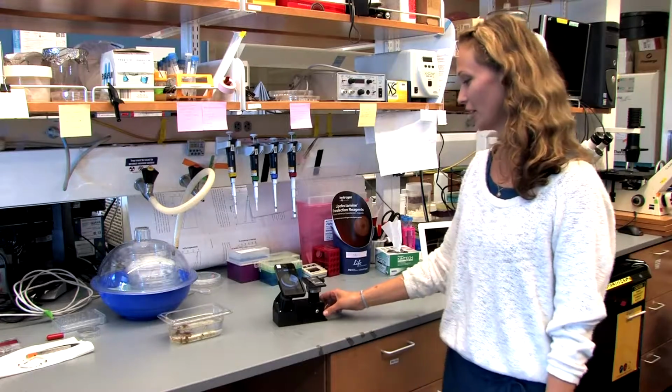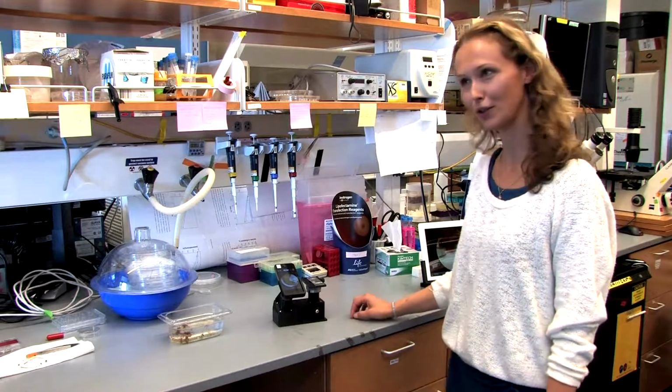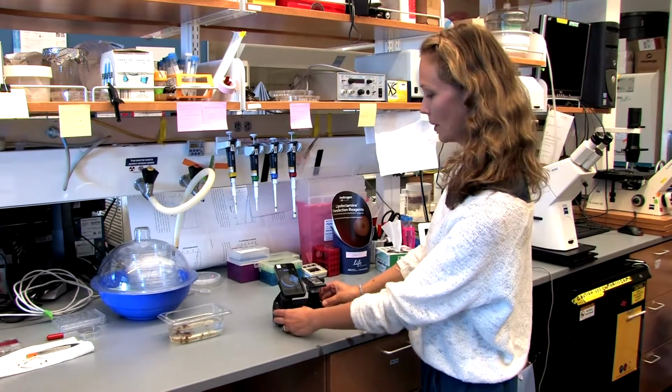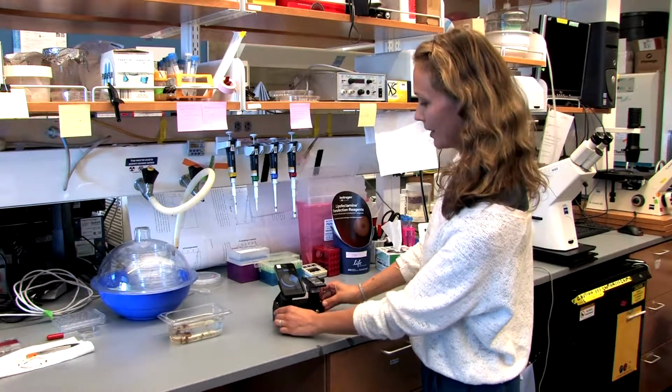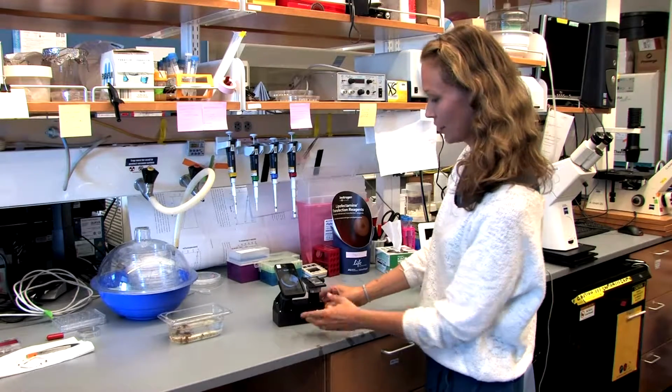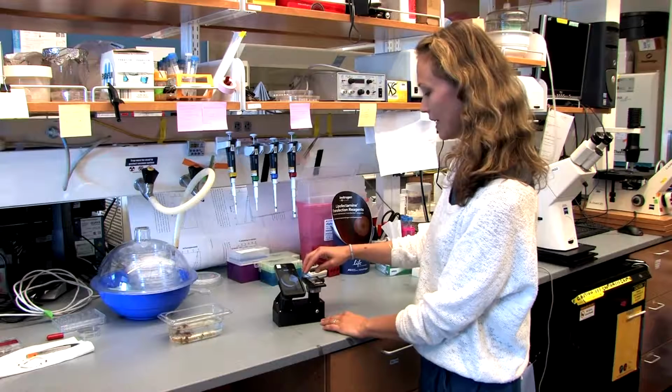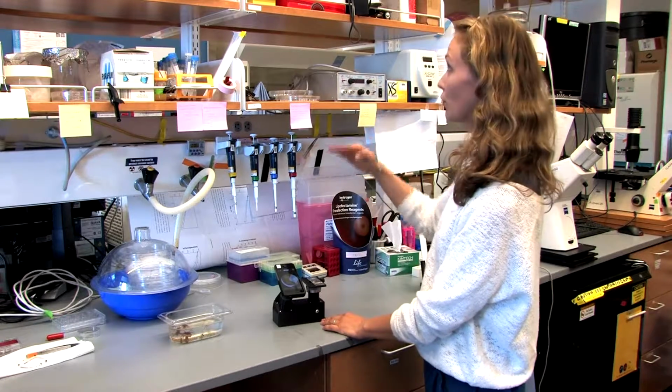This is our current version of Cellscope that we use for education. And what you see here is a 3D printed part. So all the black plastic stuff you see here is printed on a 3D printer in our lab. And you have a sample that is here on this glass slide. And the light comes in just from the room lights in this case.